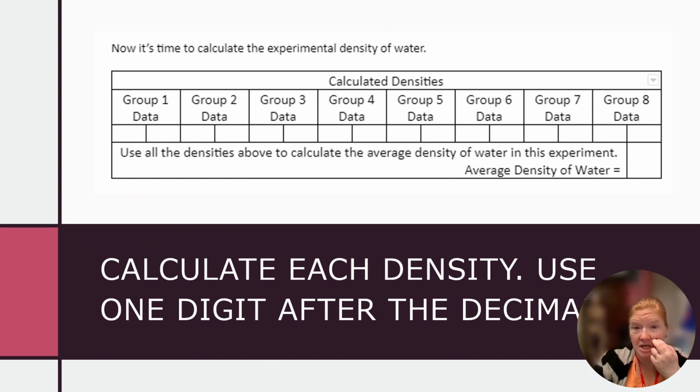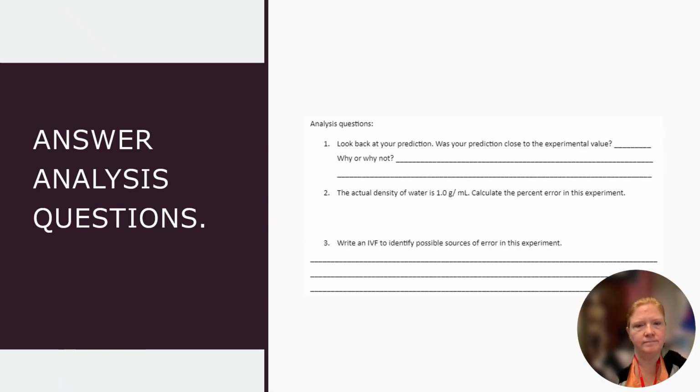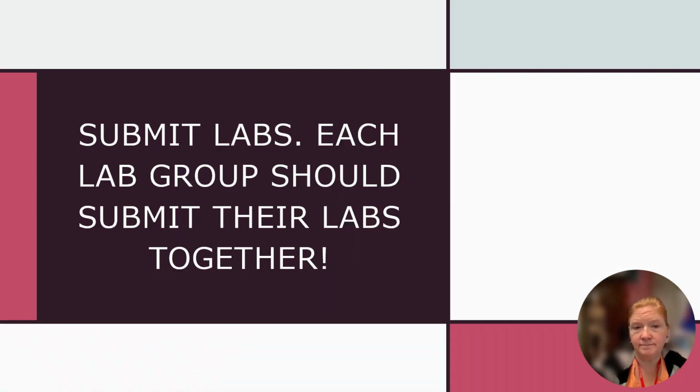Now we're going to calculate the density. So remember how group 1 had a mass and a volume for a quarter? So you're going to do mass divided by volume equals density and record this here. Mass divided by volume is density. So we're going to record all of these densities and then average them. And then you have just a few analysis questions to answer. And then you're going to be submitting your labs.